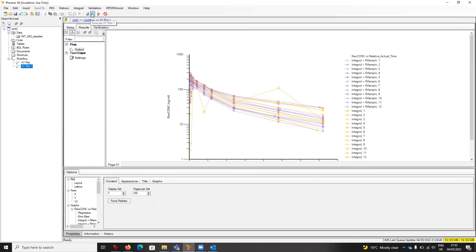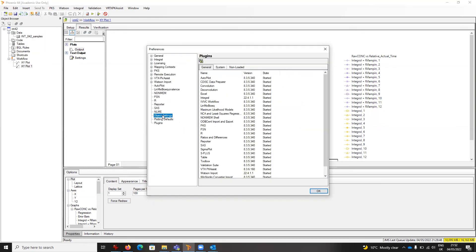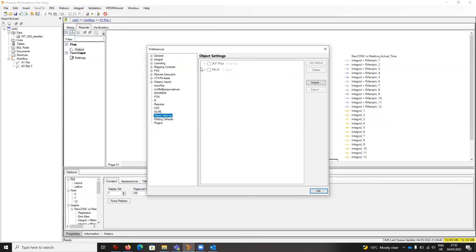If I want to manage those further, I go to Edit, Preferences, Object Settings. There you can see New Name as default, and I've also got currently my NCA set to lin log rather than linear trapezoidal as installed.